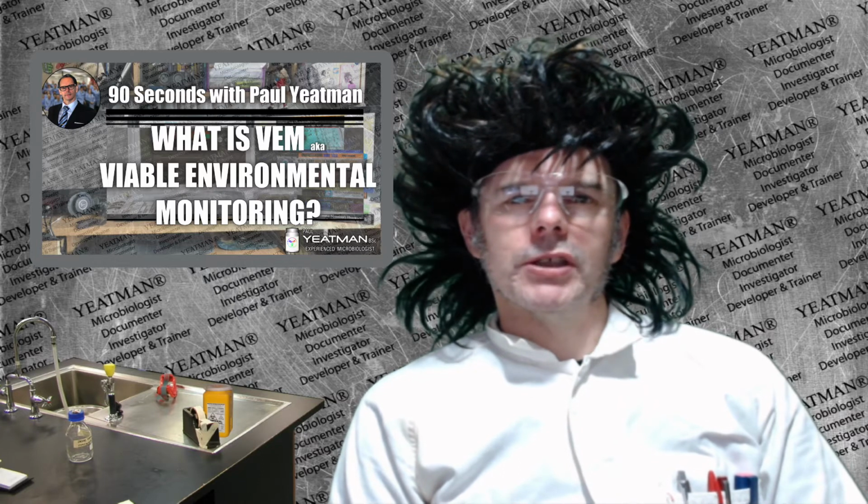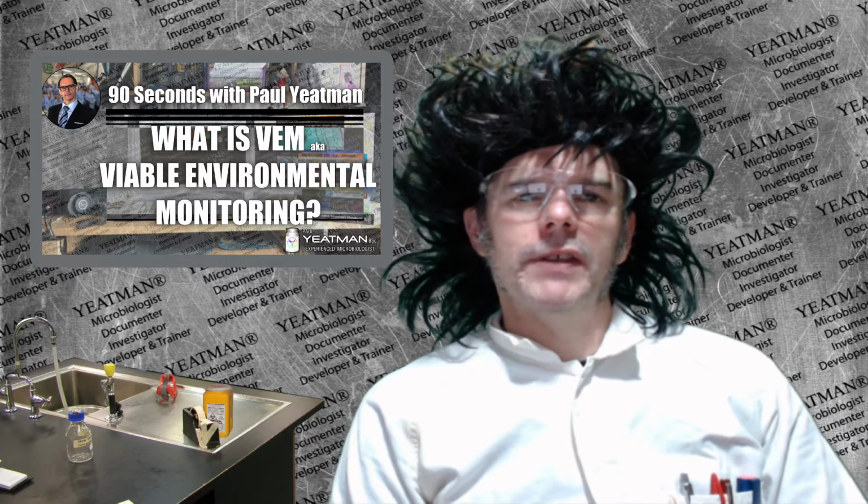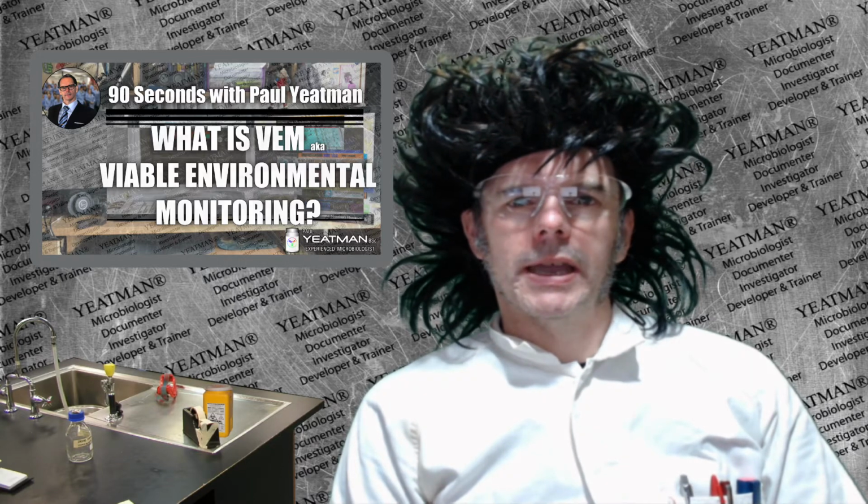In manufacturing, you want to make sure your processes are working within established parameters, and VEM is an important indicator of this. Well, that was Viable Environmental Monitoring, or VEM, in 90 seconds or thereabouts.